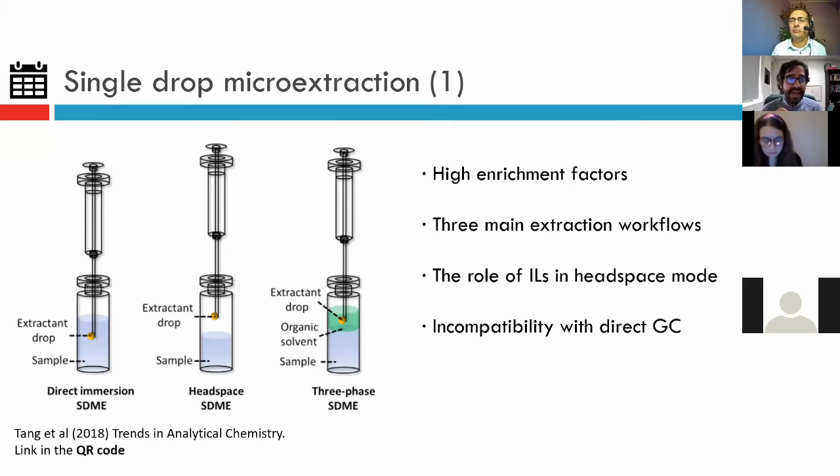In the direct immersion mode, we immerse the drop into the sample directly. So the solvent and the aqueous sample are in close contact. It is used especially for the extraction of non-volatile compounds. In the second workflow, it is the so-called headspace single drop microextraction.